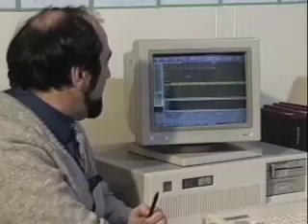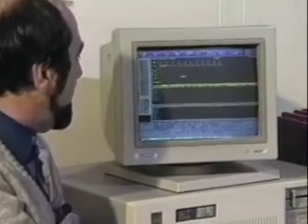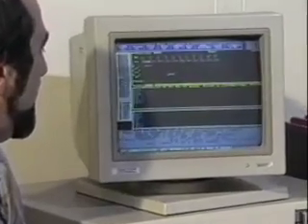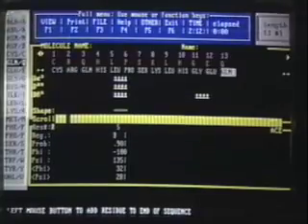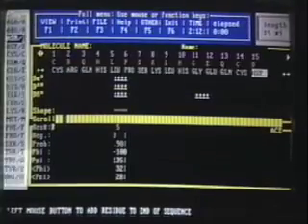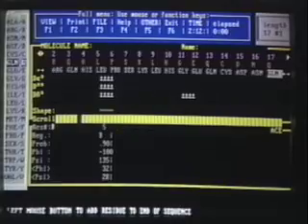Dr. Carr will now describe some of the features of this software as she, Simon, and Alan demonstrate the various components. The current version of the Phi-Psi NOE program runs on a personal computer. It is a user-friendly program with convenient pull-down menus for the input and editing of amino acid sequences and NOE information.